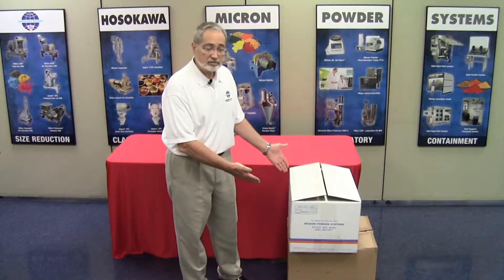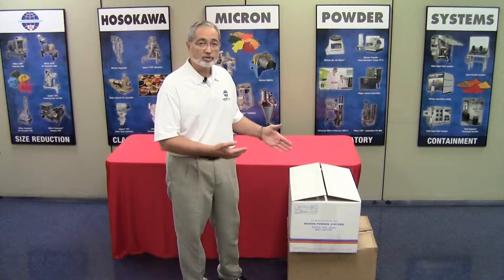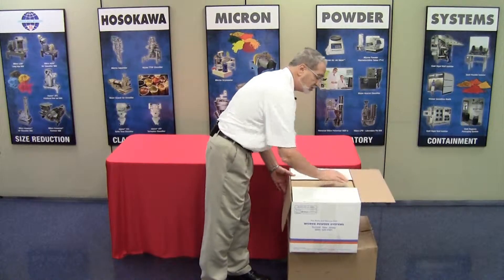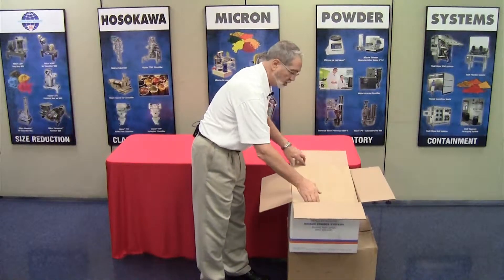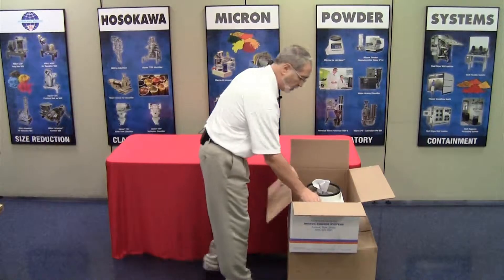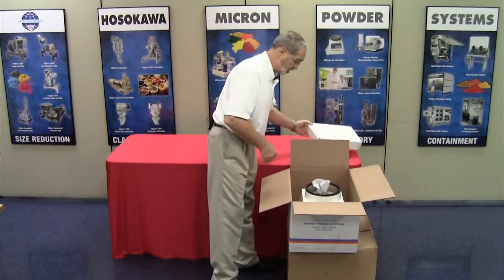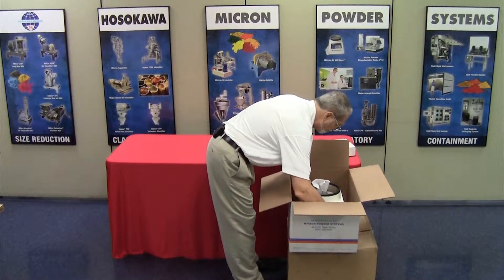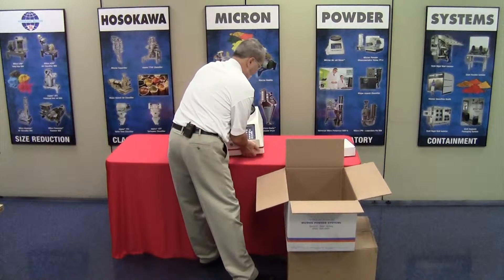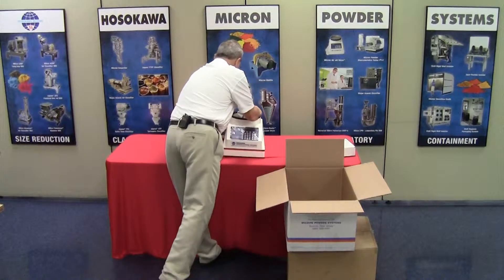When you get the cartons, please inspect them to make certain that there is no damage to the exterior, which could potentially have caused damage to the actual product. Open the cartons, which have been pre-cut. Remove the cardboard protective assembly. You will have a white box, which is your accessory box. Set that aside for the moment and lift out your unit. Place it on a firm analytical table and set the unit in place.